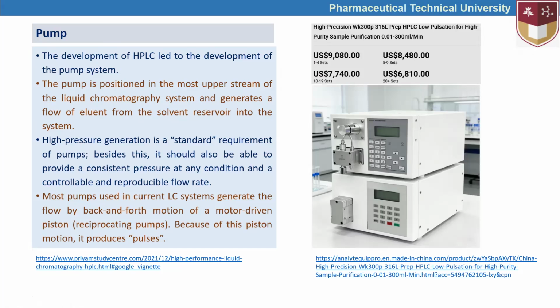Otherwise, if there is a difference between the flow rates of the studied sample and the standards, we can witness some differences, and those differences might cause some complexity in the study process.